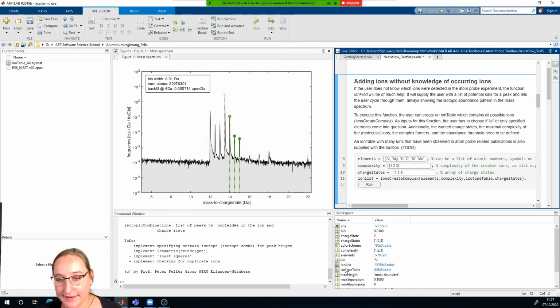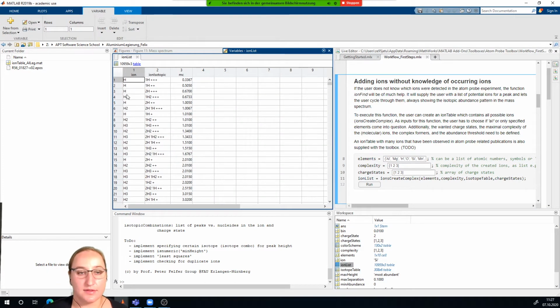Because when you have your ion list now, it looks like this.